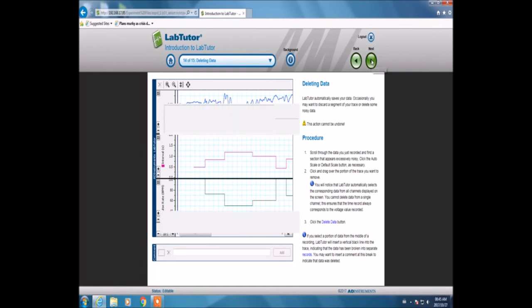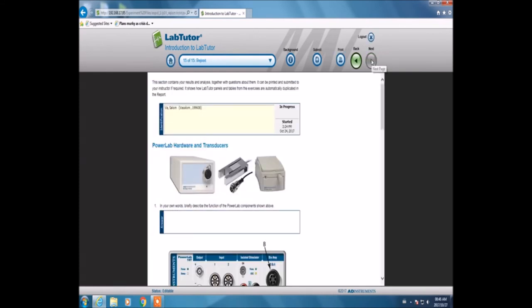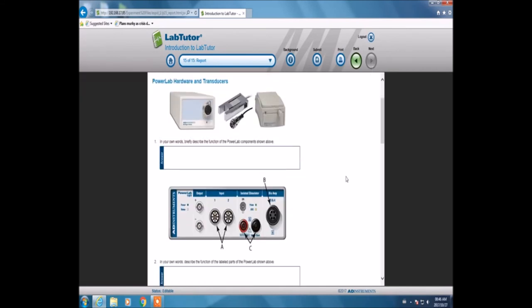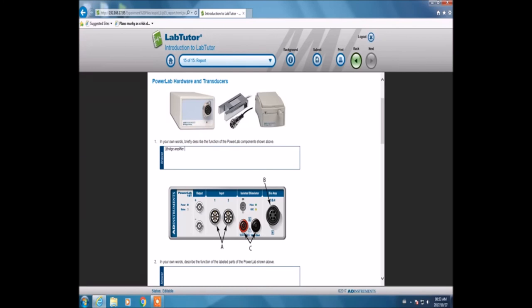This is where we write the report. You have to fill in the information here—basically answer the questions that are asked. After filling in all the answers, you're required to submit the report. This enables you to complete your reports much faster as you do not have to follow the normal procedure in writing a report. It's more straightforward and more student-friendly and time-friendly.